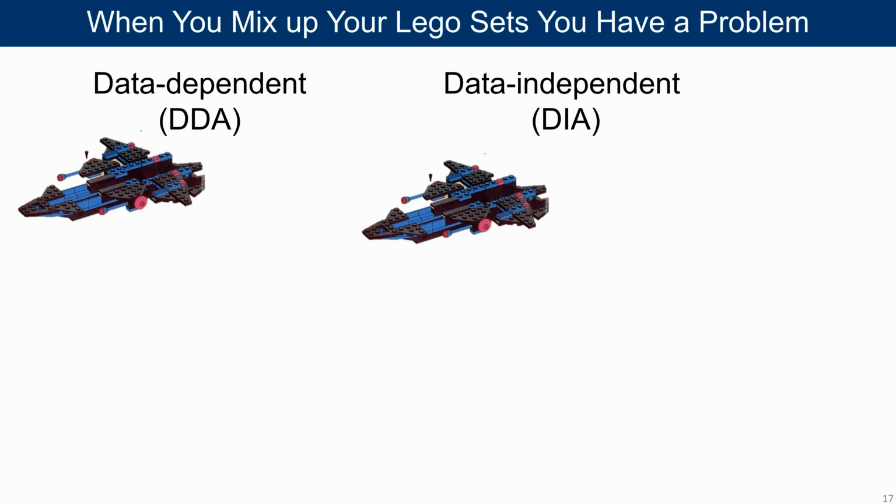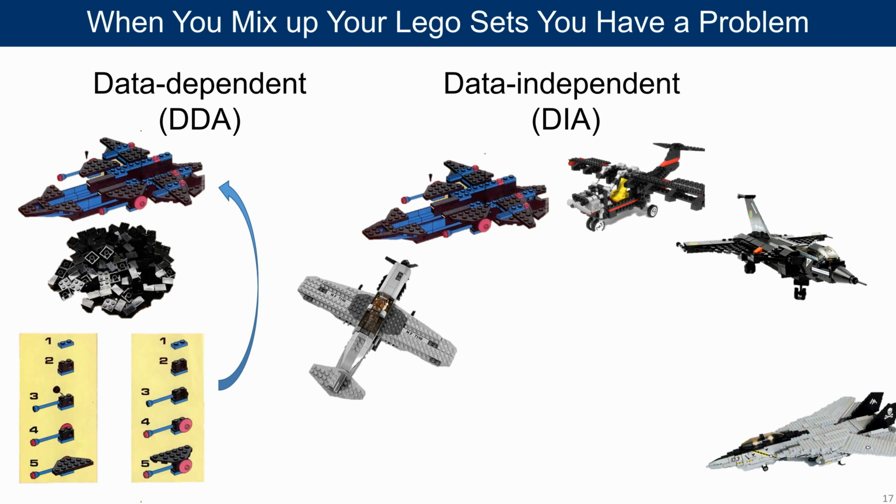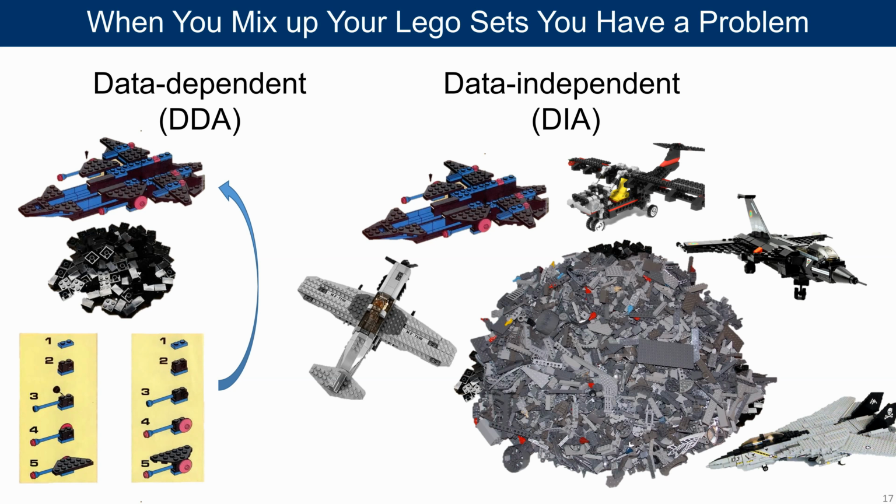The problem is, in data dependent, it can be relatively simple to reconstruct the structure because you have all the pieces, and if you have an MS/MS library, you have the instruction manual, so you can build that Lego set. But in data independent analysis, now maybe your hobby is putting together Legos, maybe your child's hobby is taking apart Legos and throwing them all over the rug. It takes all your Lego sets and puts them on the rug, and now you don't know which Lego piece belongs to which set, and it's a headache trying to build back what these structures are.